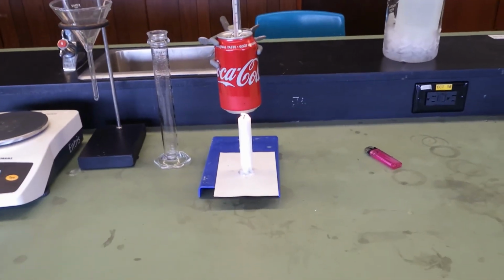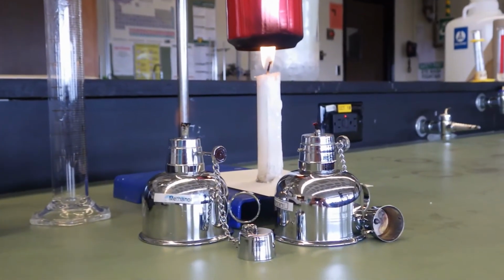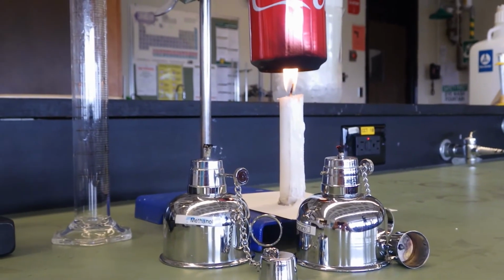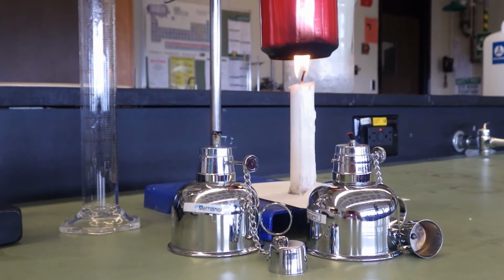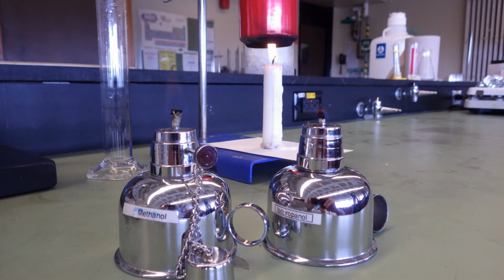Why is that? Well, alcohols are liquids that boil at low temperature. Combustion occurs in the vapor phase, so the alcohol lamps burn readily. But remember, wax is a solid. It has to melt before it can even vaporize, so it requires a higher temperature to burn completely. We have unburned carbon. This is incomplete combustion. It's just the nature of the candle wax.